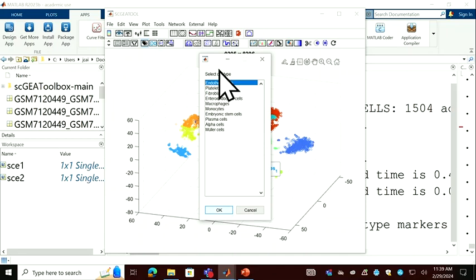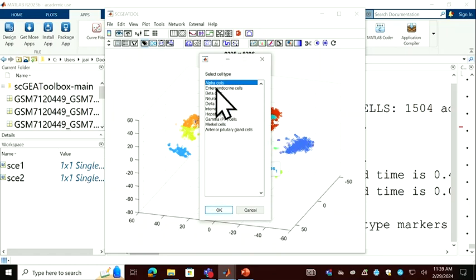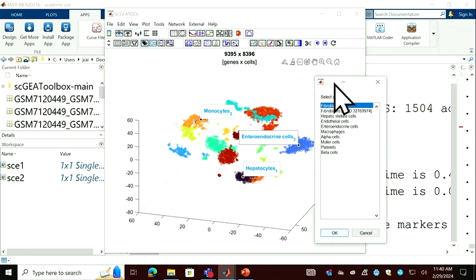Then the second option, this is for the second cluster. Remember, I have 15 different clusters. This is my second. If I believe they are macrophage monocytes, I just randomly select renal cell, fibroblasts. How do you know which one is cluster 1 and cluster 2? Yes, I don't know yet, but you can label them with the numbers.